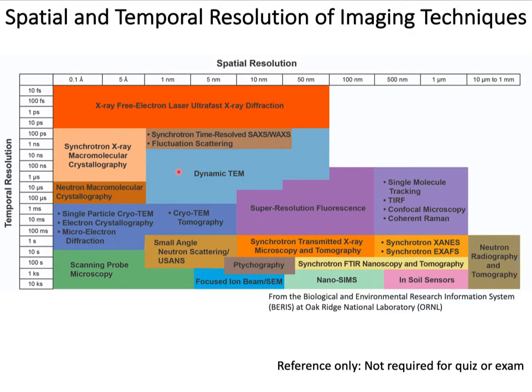But if you see the cryo-TEM in the dark blue, with the mind-boggling computational power, you can even visualize a single atom at the resolution of 0.1 angstrom, or 0.01 nanometer. This is how we visualize the biological macromolecular detail of the proteins, carbohydrates, nucleic acid, atom by atom.